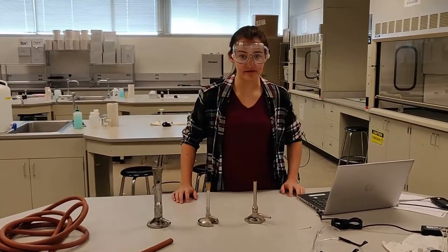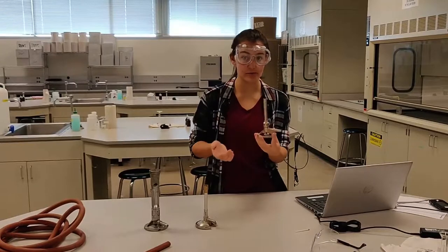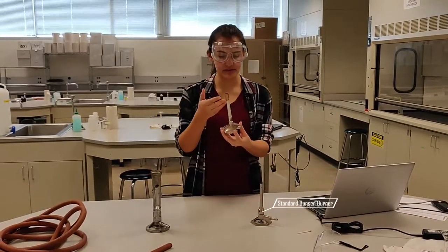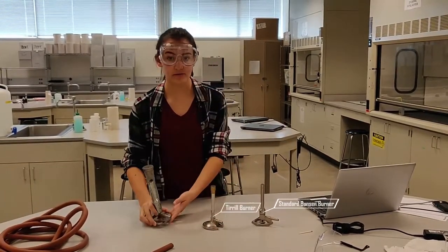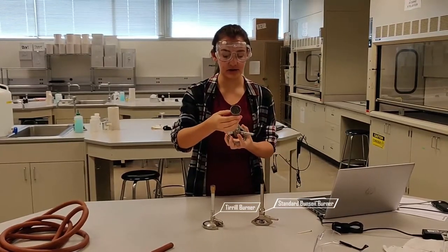There are several types of Bunsen burners you can use in the lab. There's the generic Bunsen burner, which you're probably familiar with. There's the Tirrill burner, which includes a flame stabilizer on top. And there's the Meker-Fisher burner, which produces multiple flames and is used for extreme heat or a wide range.